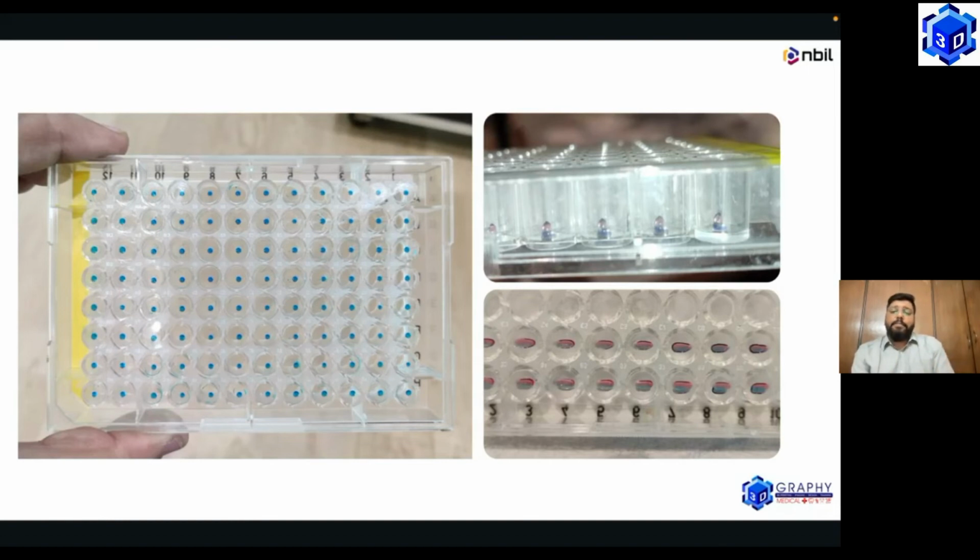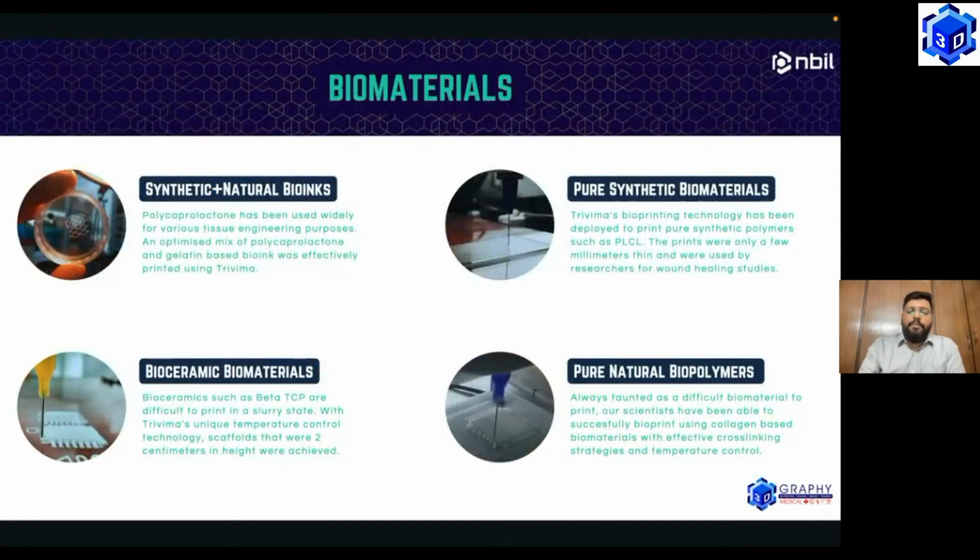Very interesting project, but this showed us the true potential of how customized technology can help in developing novel solutions for clinical applications, or even for drug development in this case. So, we also worked with other scientists in India. When the technology was developed, we told people that we had a bioprinter in house. We wanted to technically validate it, and many researchers were nice enough to give us materials.